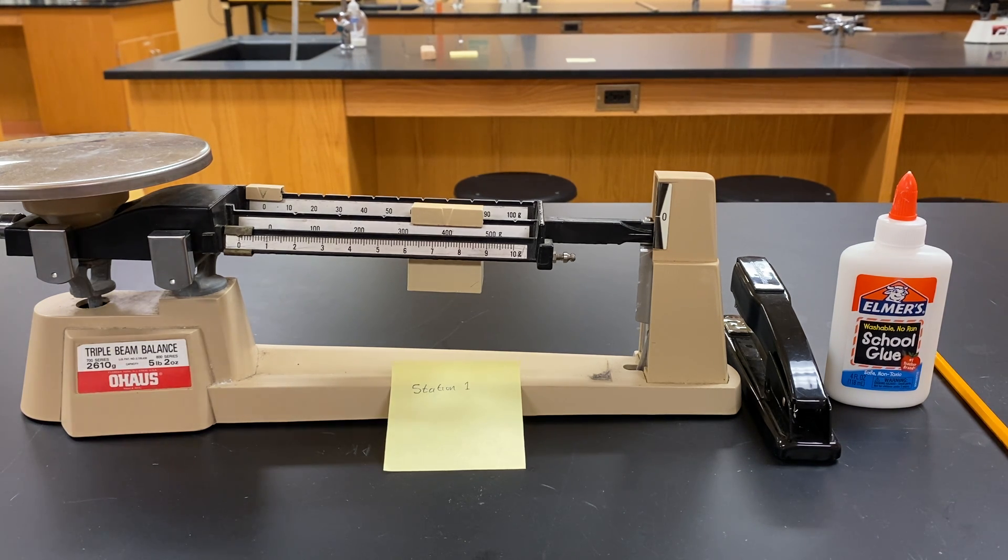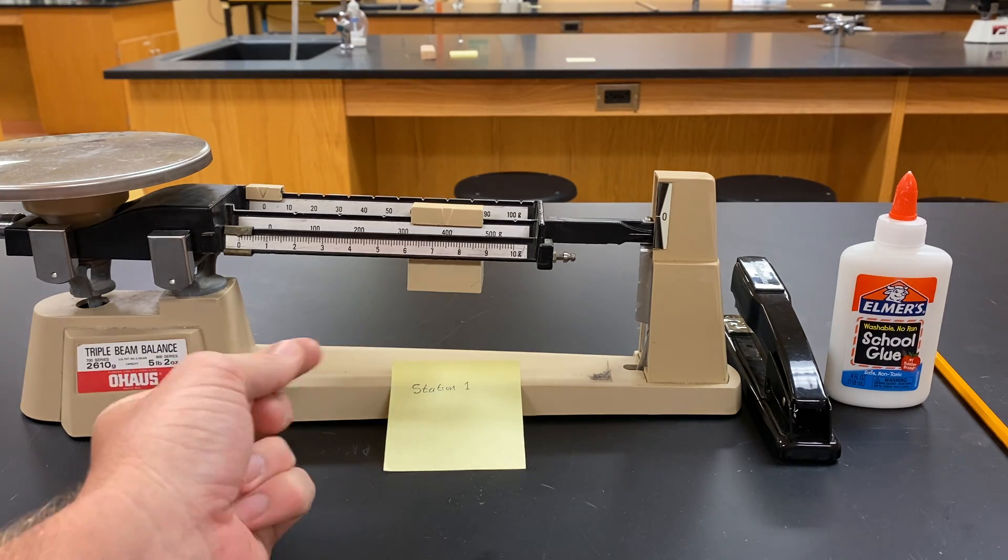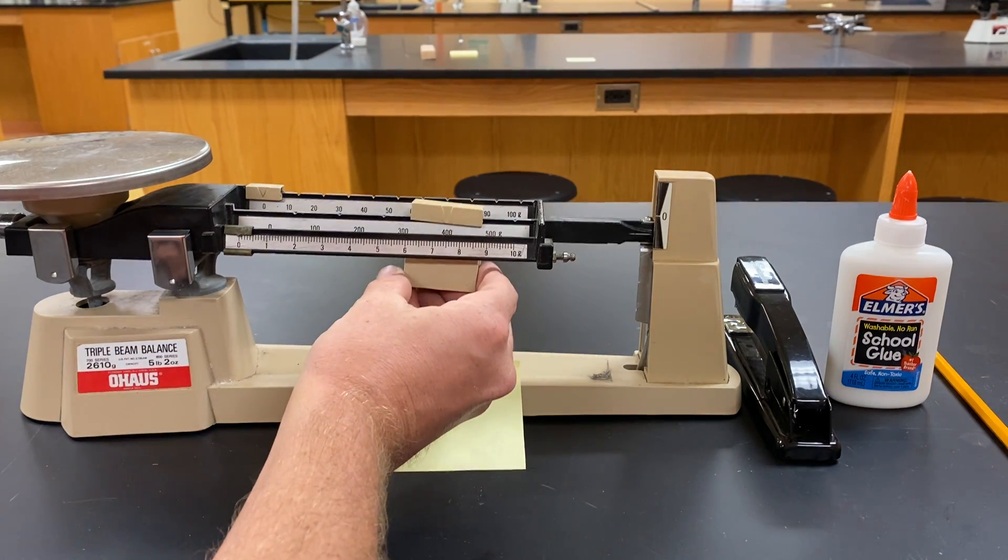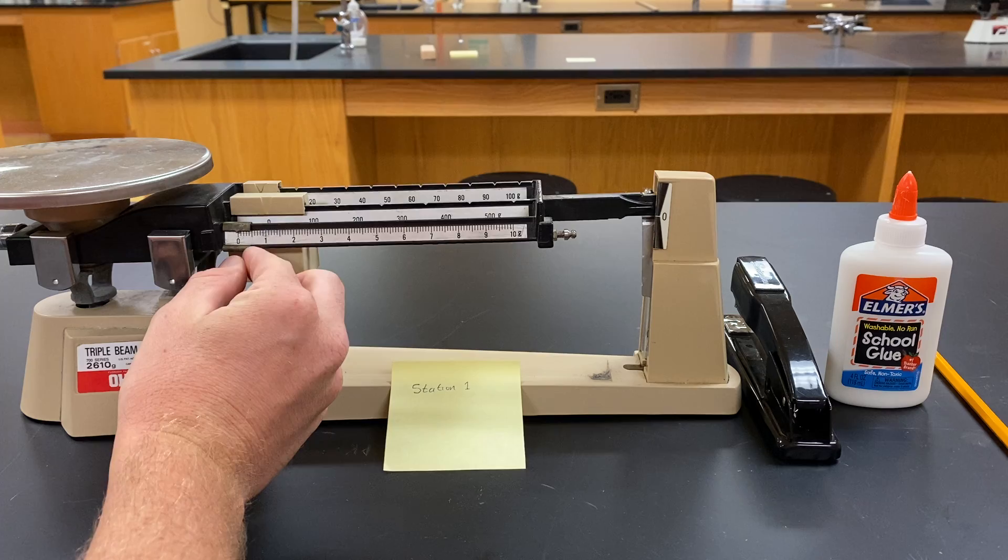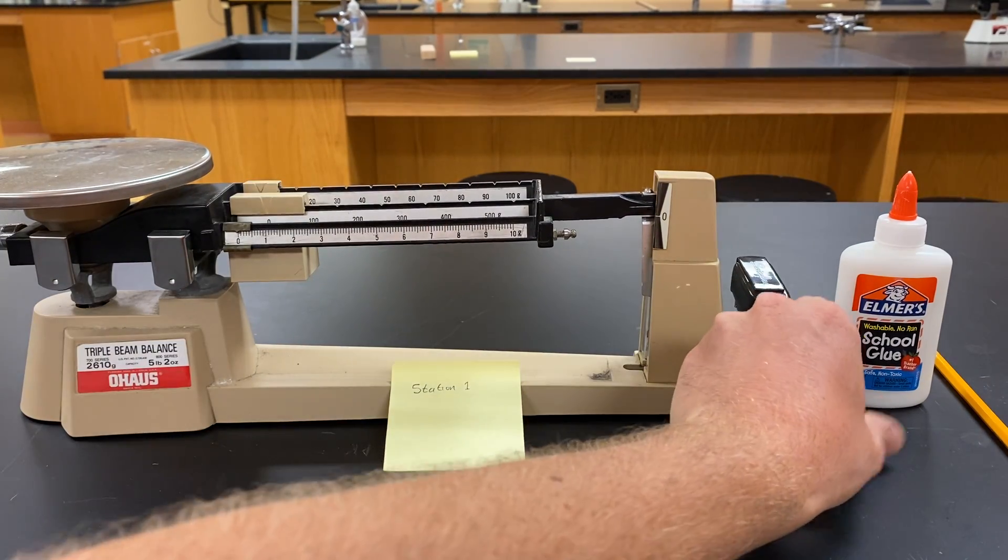In order to find the mass and use the triple beam balance, the first thing we're going to do is zero out our scale. We'll start with all of our weights all the way to the left at zero.